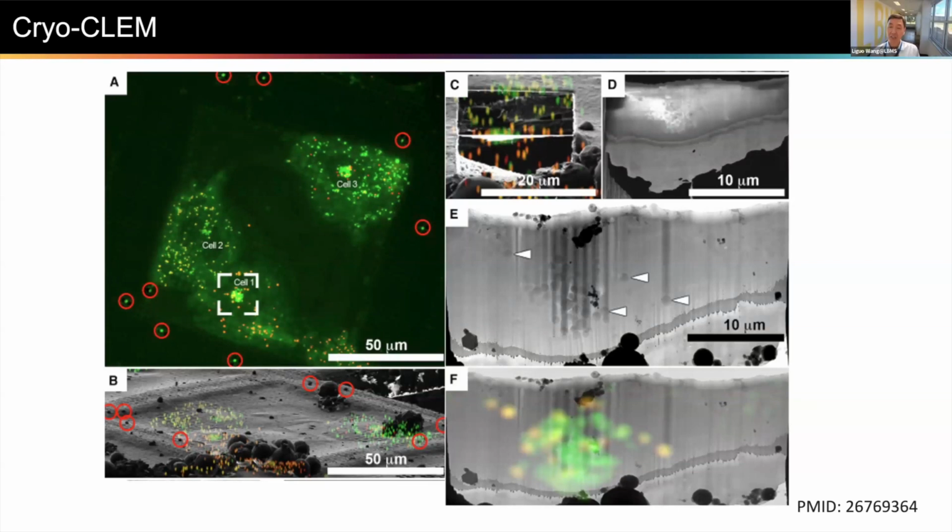Yes, it's just like a book. It's very thin, but when you lift it over to 90 degrees, it's much, much thicker. And also the TEM grid is made of metal, so it will block most of the signal at high tilt. Right.